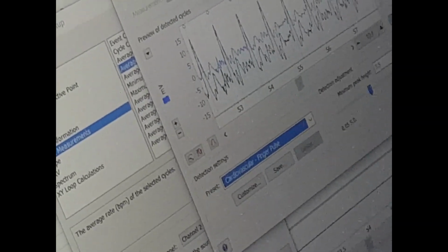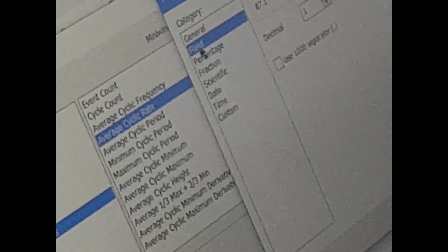If you were using a respiratory belt, then you would select respiratory belt here. If you were using something else, similar. Then you can also format, because you will not have heart rate in fractions. Either it will be 67 or it will be 72, not 72.379. So you make the display a fixed decimal. We don't need any decimal.